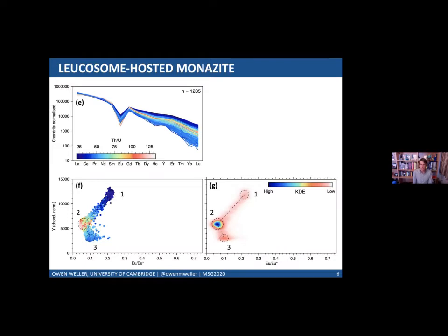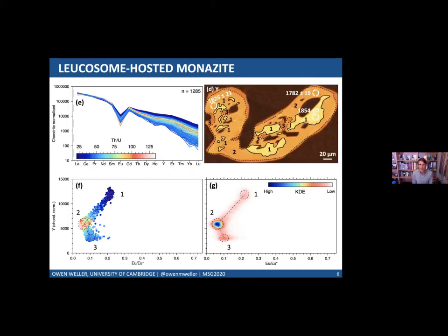This is partly based on consideration of the kernel density estimates. The figure on the bottom right shows you the data density, and you can see that most data belongs to position number 2, and that you have more intensity at the end-member locations relative to the intermediate locations. But perhaps the most compelling piece of evidence for why this grain is defined by 3 distinct chemistries is when we looked back at the yttrium EPMA qualitative chemical map shown on the top right. You can see that this has 3 different intensities, which are indicative of 3 different yttrium contents, hence the 1, 2, 3 below.